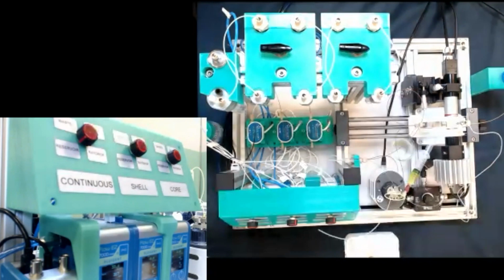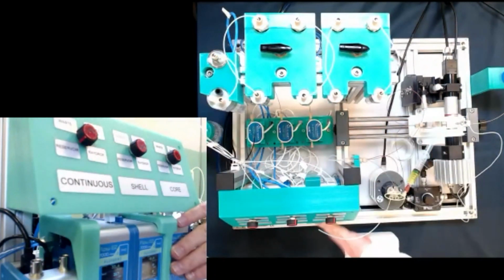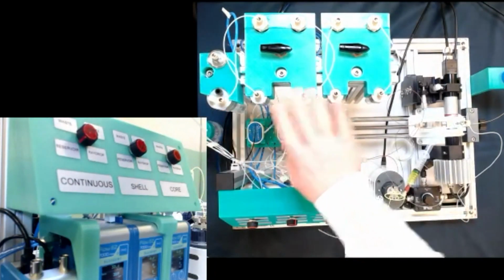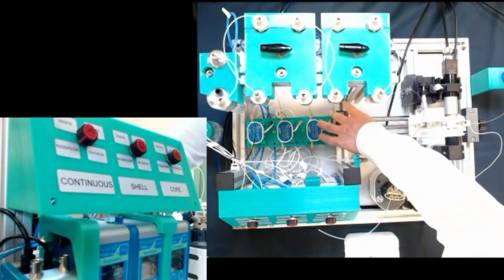So here you have the Raydrop platform. On the left part, you have the 3D installation, I would say, with the pressure controller at the bottom here. You will have then the reservoir, so continuous phase reservoir, shell phase reservoir, and core phase reservoir. You then have filters in the back. You will have then flow meter here.